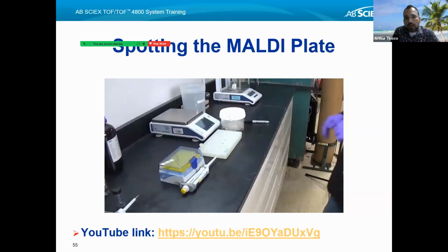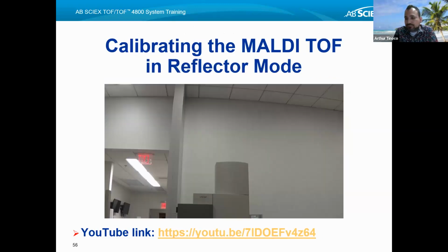All right then. So that basically concludes the process of calibrating the instrument, collecting your data, and also analyzing data. It's actually extremely quick, the process of collecting the data and sifting through it. But the key thing about maximizing the success of your analysis is all the brain work to figure out what are the possible mass spectra that you're going to see. So before we conclude, do you have any questions, any doubts?